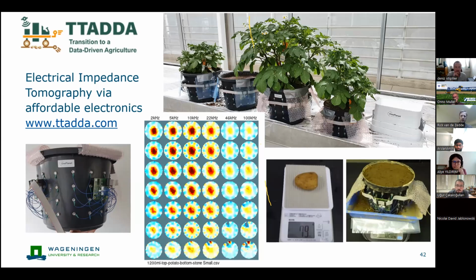It is basically a whole bunch of electrodes that are connected through these screws, and they are in contact with the soil. So inside the pot, there's nothing except the other end of the screw. And we measure the electrical impedance by quickly monitoring the current between all the different combinations that you can imagine between these screws.